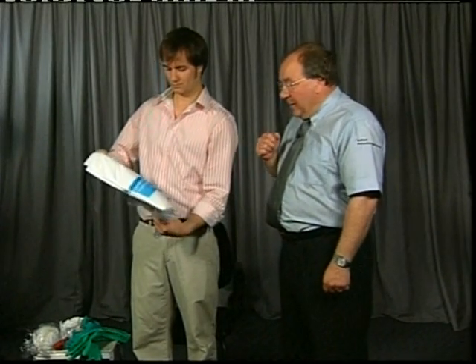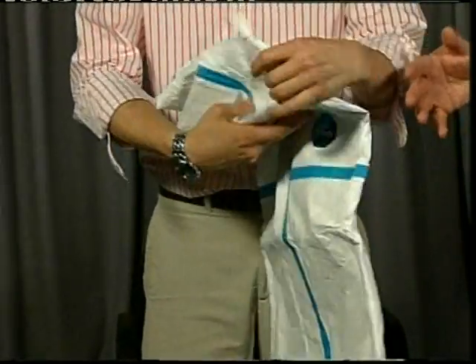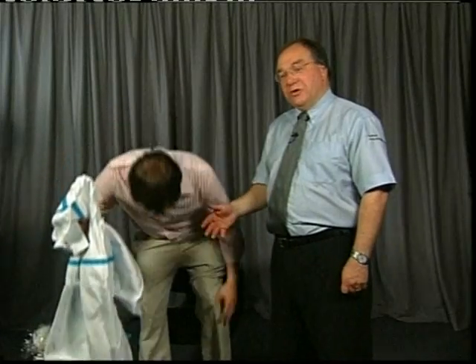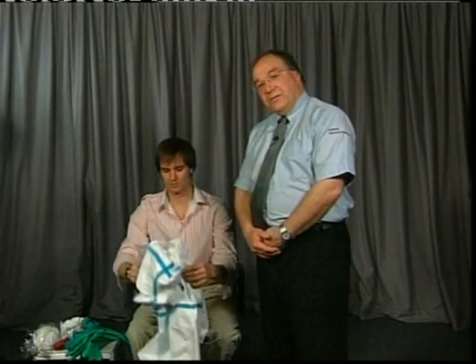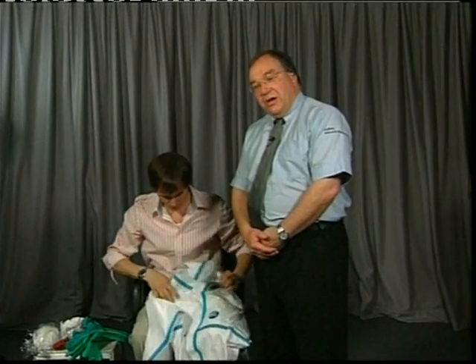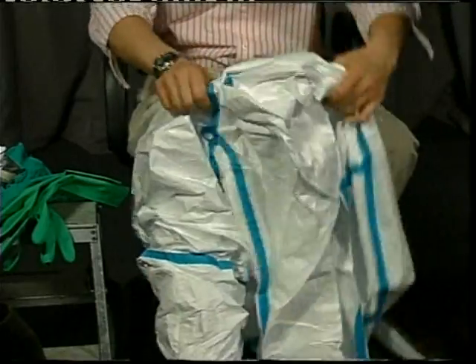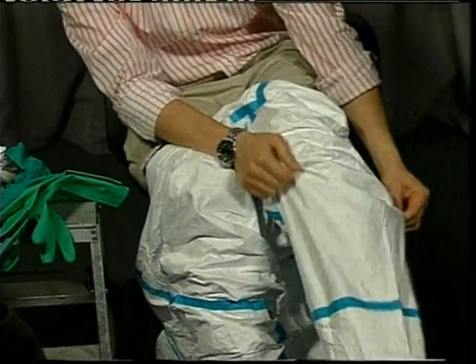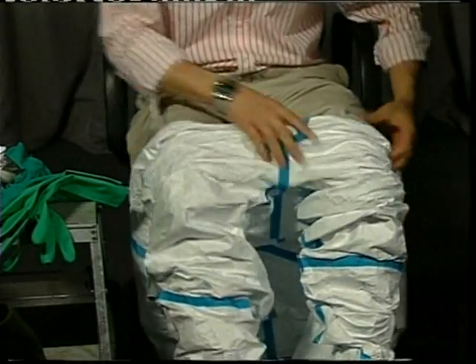Take the suit out of the bag. As you take the suit out, depending on where you are, you're looking to sit down. In a safe environment you can sit in a chair, but if you're out in the field you need to find somewhere safe — a vehicle, a wall, a crash barrier, the tailgate of a vehicle, anything to sit on and take the weight off. Once sitting, remove your footwear. This allows ease of dressing, and more importantly, no contamination from the sole of the footwear can be transferred to the inside of the garment.